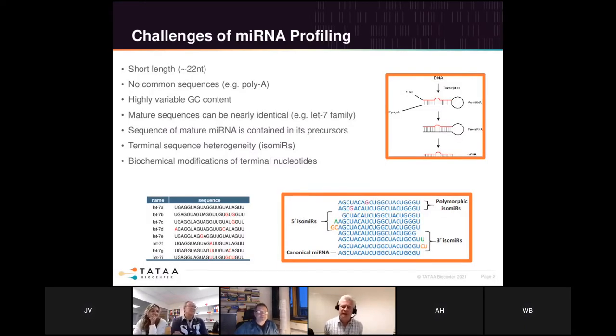So what I will be doing today is presenting a variant of PCR. We call it two-tailed PCR or 2T PCR, that has certain advantages when analyzing certain biomarkers. And one of them is microRNA, that we've been speaking about quite a lot.